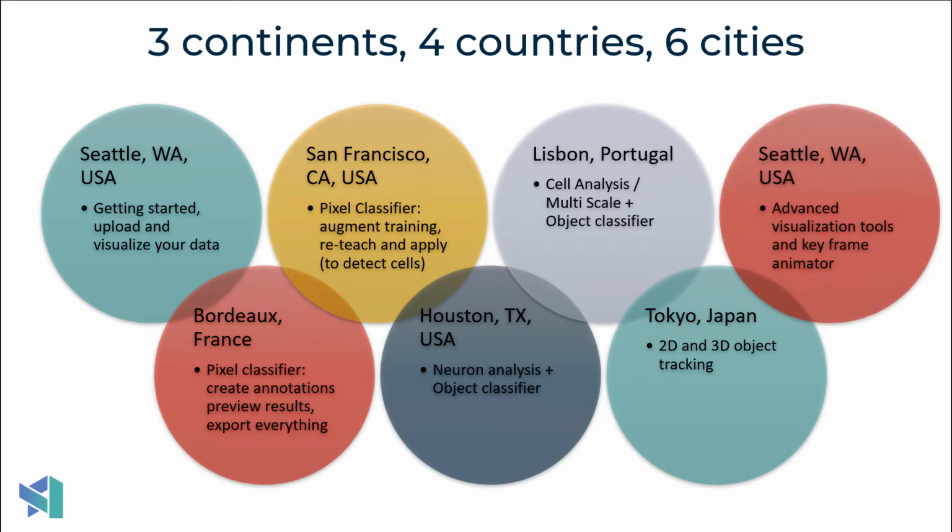So we'll do a series of very brief demonstrations of Aivia Web, and you can see what we're going to be doing. We start with a quick start guide on how to get Aivia Web running and how to upload some data and visualize it. And then we'll progress through some of the key features that Aivia and Aivia Web can offer. And we'll finish with visualization, creation of videos with Aivia Web.